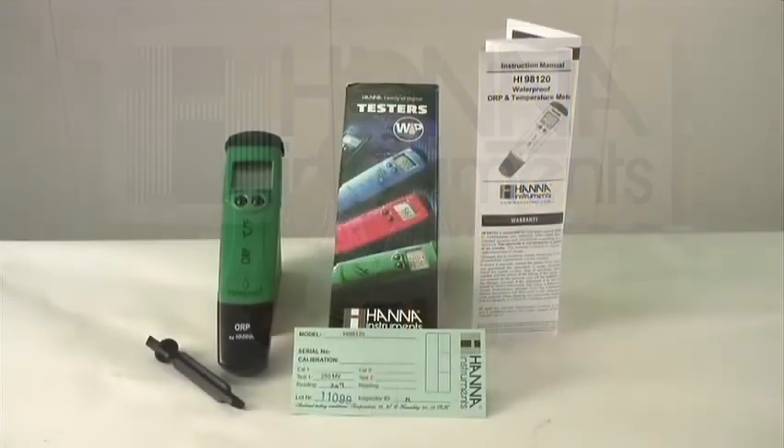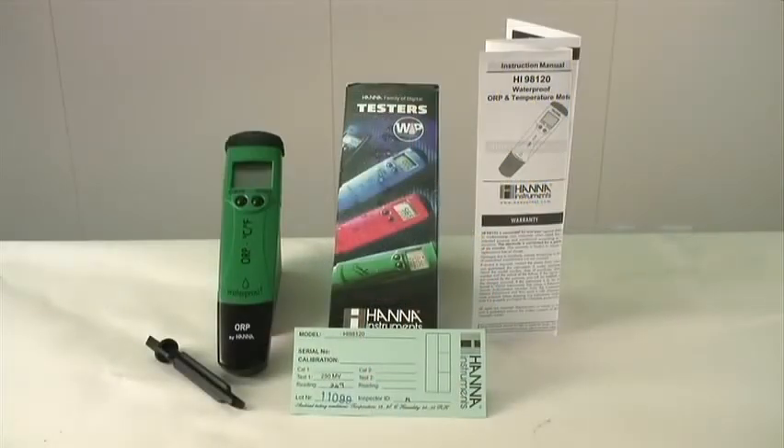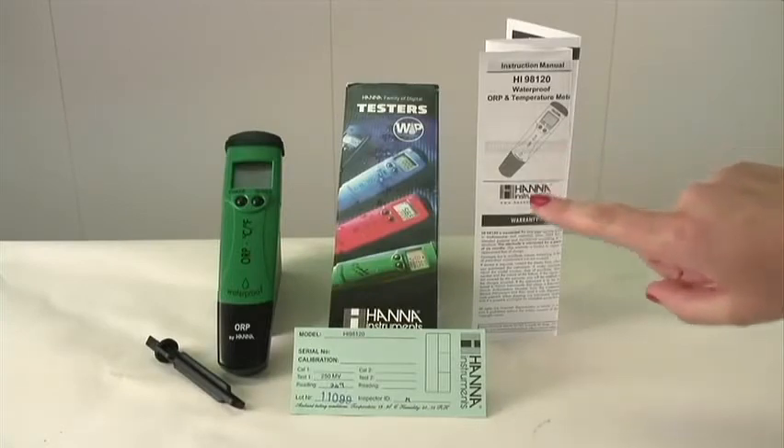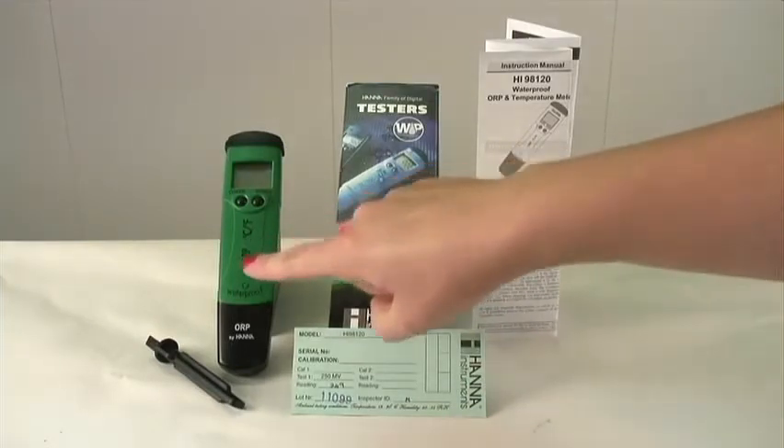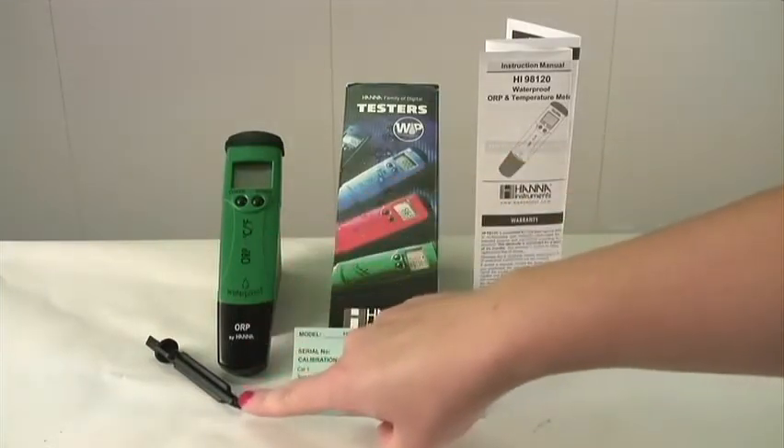When you receive your meter it will come in a box that looks just like this. Let's open up the box and see what comes inside. There should be four objects within the box: directions, calibration certificate, your ORP and temperature meter, and an electrode replacement tool.